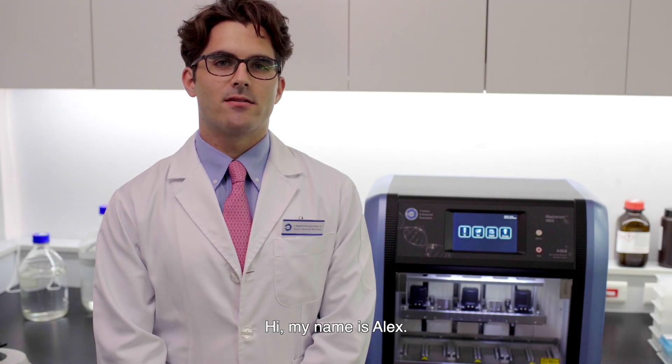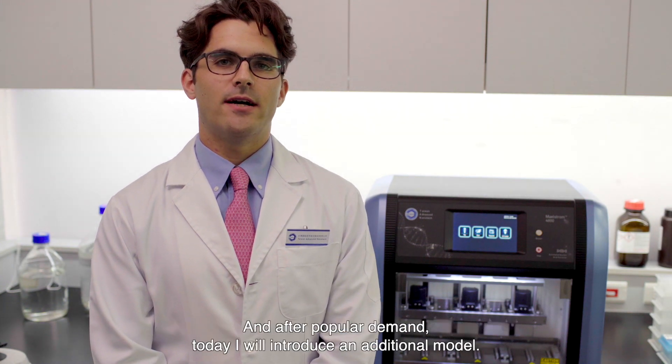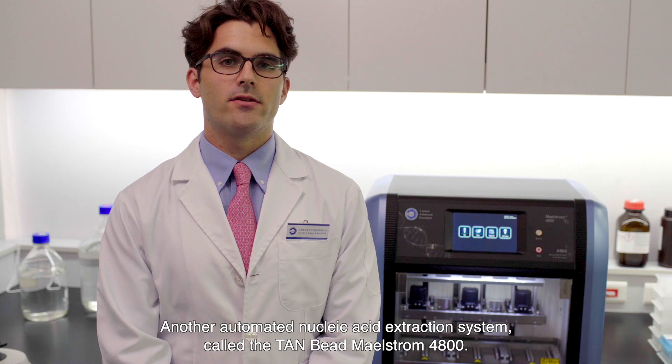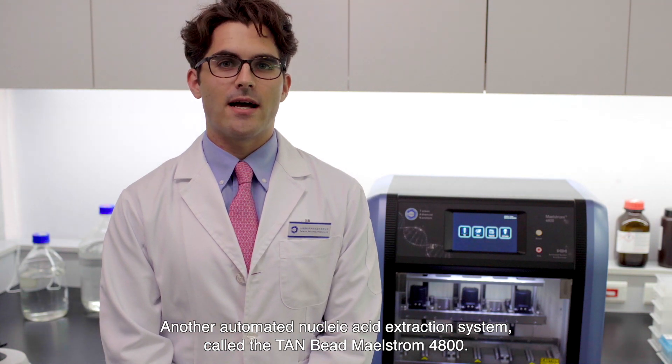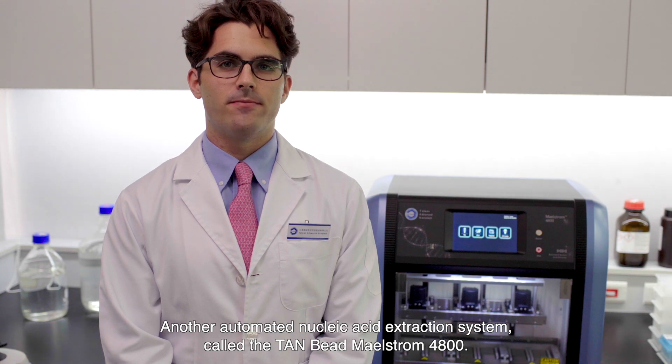Hi, my name is Alex. Last time I introduced the Tambead Maelstrom 9600 and after popular demand today I will introduce another automated nucleic acid extraction system called the Tambead Maelstrom 4800.